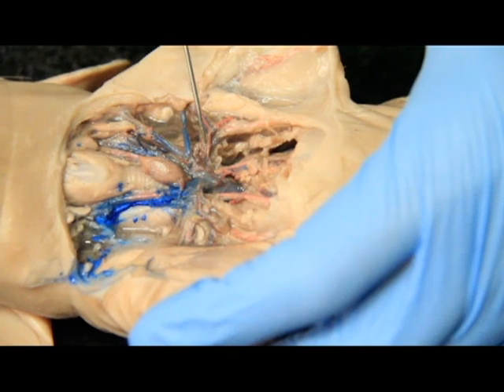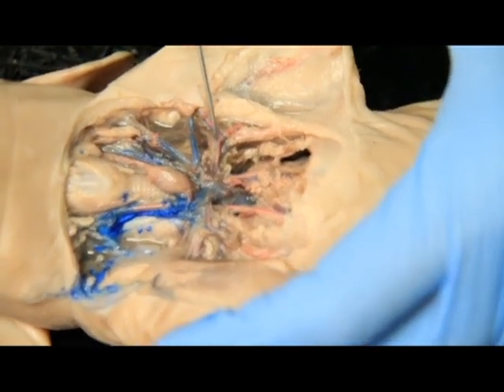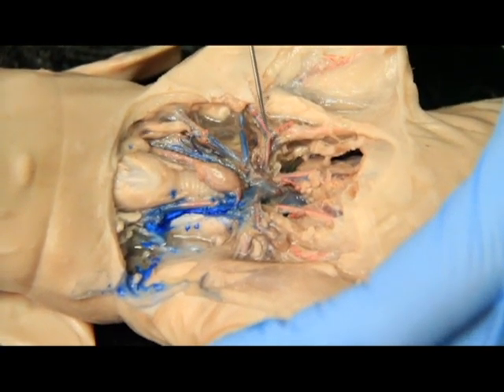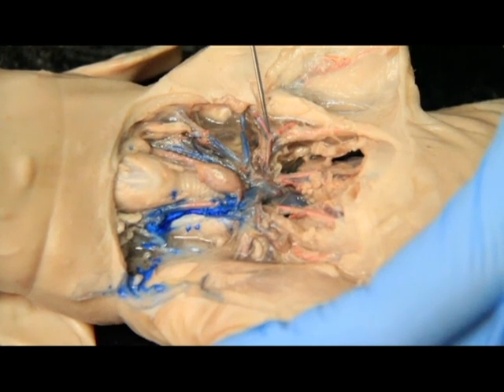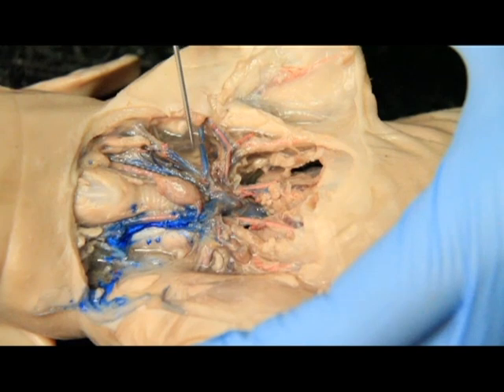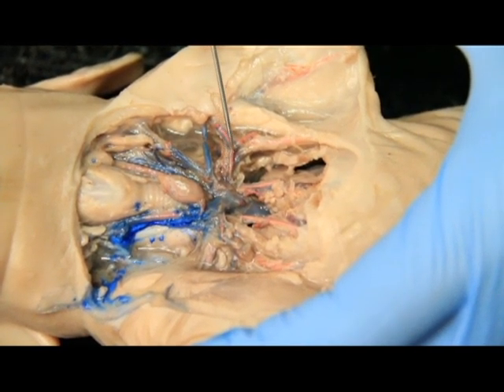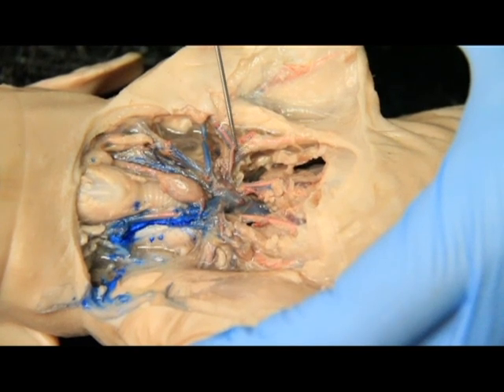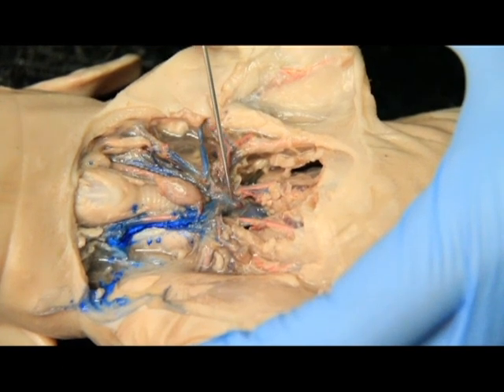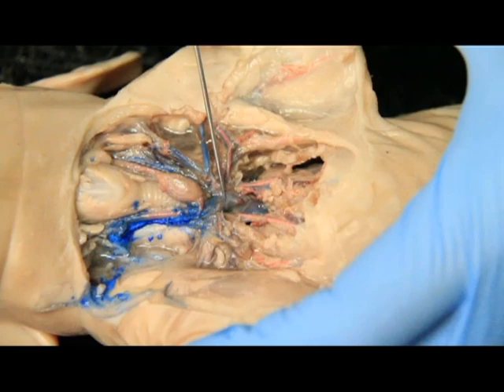So you can see it's the second branch off this brachiocephalic trunk after the cephalic, from here to here only, this first section. And then it's going to branch upwards. This upper branch is going to be your subscapular, and this lower branch is going to be your axillary. So again, 1 jugular, 2 cephalic, 3 subclavian, 4 subscapular, 5 axillary. And your brachiocephalic vein right here in the center. Remember, this big blue area is your brachiocephalic vein right there.